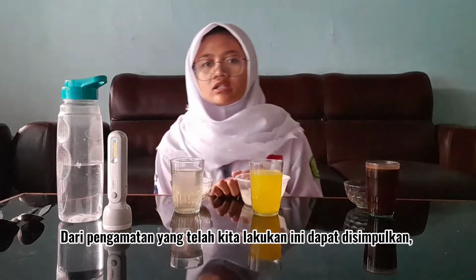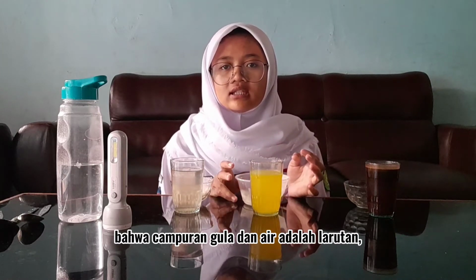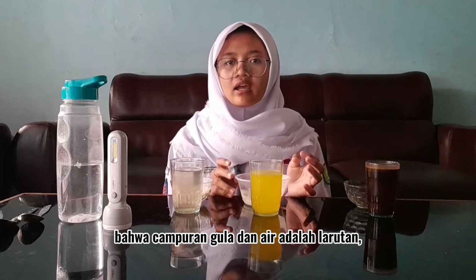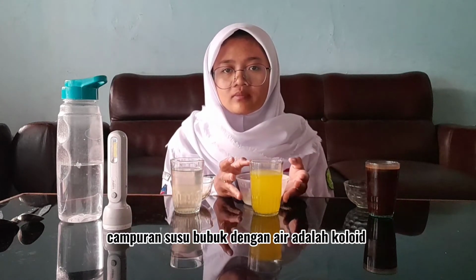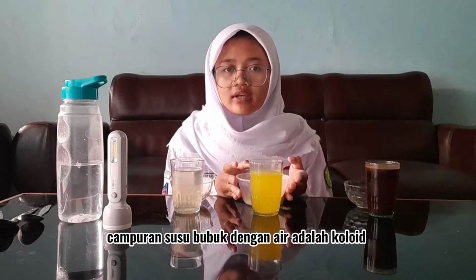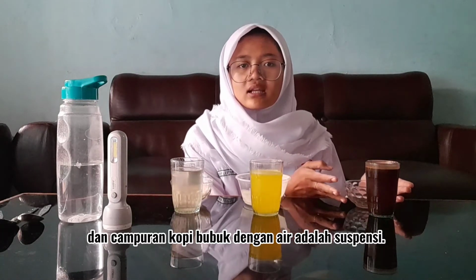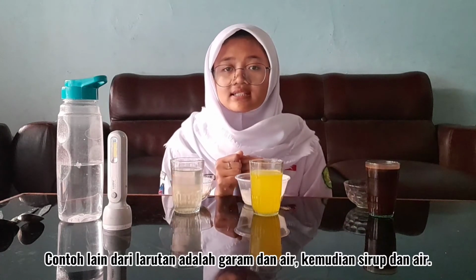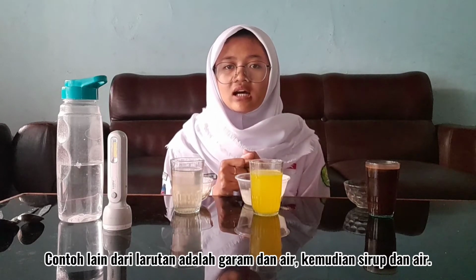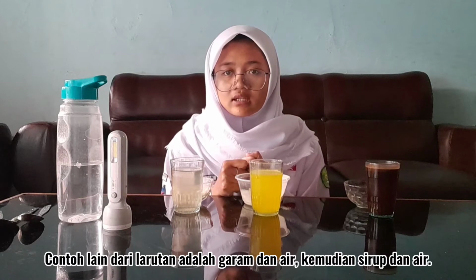From the observation we have done, it can be concluded that the mixture of sugar and water is a solution. The mixture of powdered milk and water is a colloid, and the mixture of ground coffee and water is a suspension. Other examples of solutions are salt and water, then syrup and water.